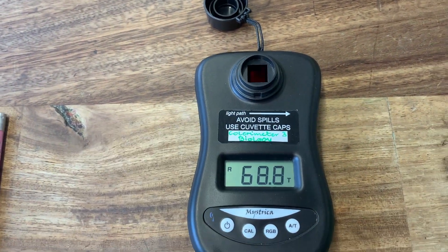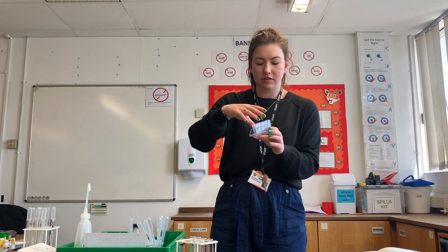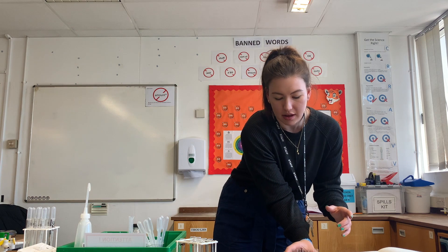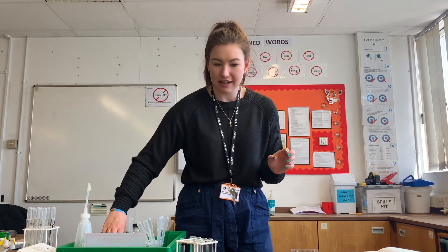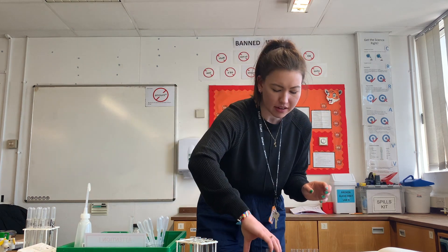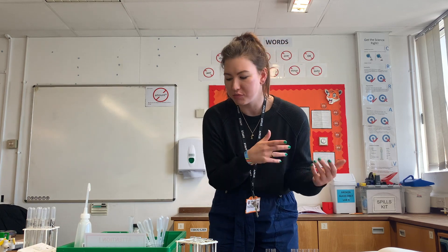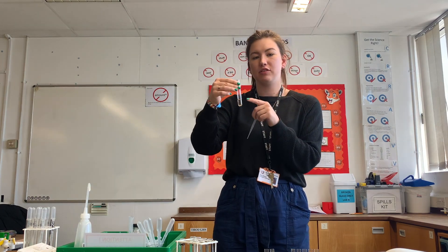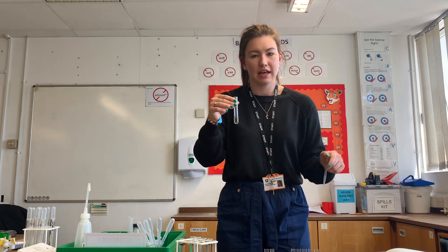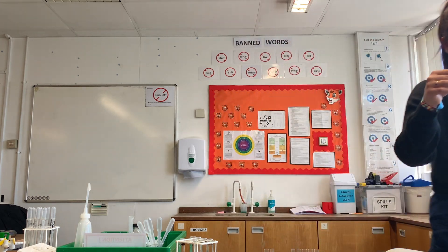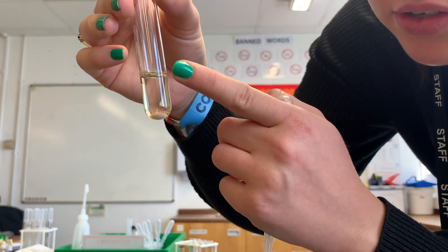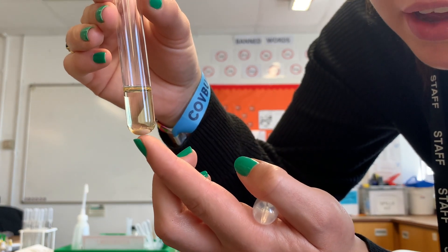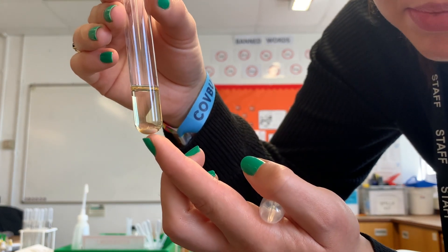I've got some cuvettes here in a little stand. I'm going to label the cuvette stand but not the cuvettes themselves, because otherwise the pen would block the light from shining through. I need to pipette the supernatant from my centrifuge tube into its cuvette - the supernatant is the liquid part, and the pellet is the precipitate at the bottom.